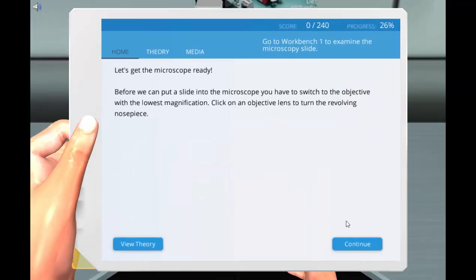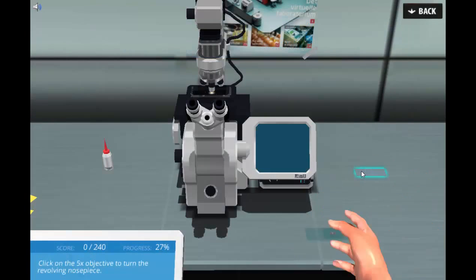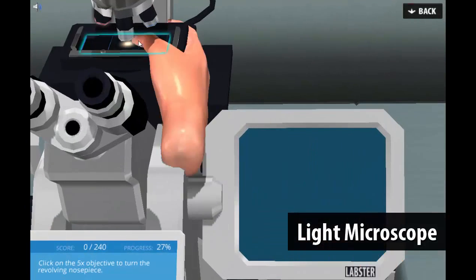Accessing the virtual lab, students learn how to operate a light microscope and understand the mechanisms behind it.